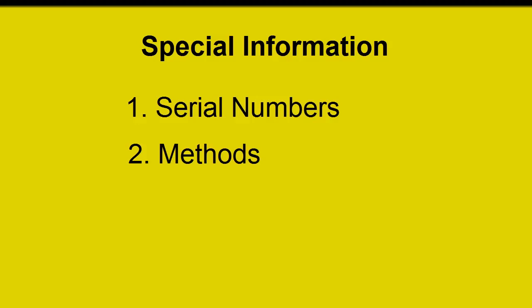You'll also want to include any information about the method that is being programmed into those instruments. For instance, if you're running a gas chromatography experiment, you want to make sure that you include information concerning the oven temperature, injector temperature, gas flow rates, etc.